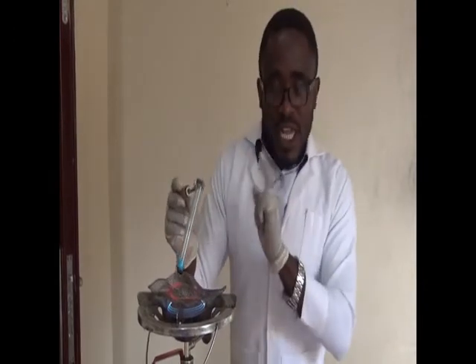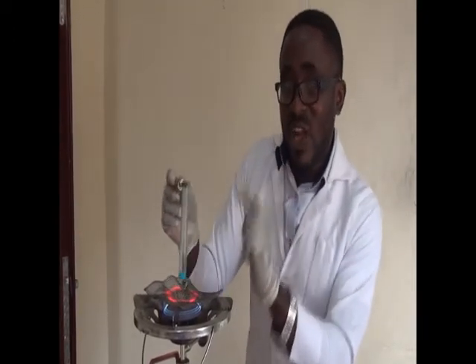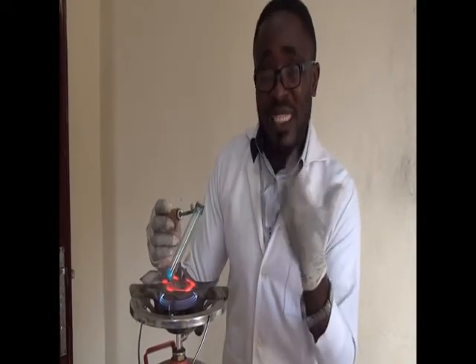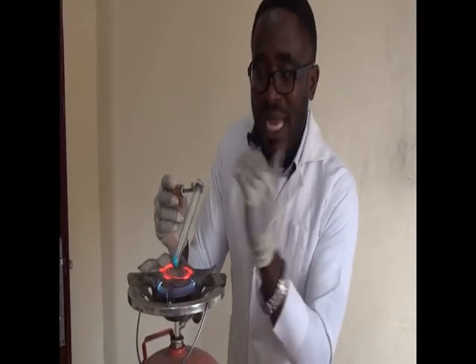Please notice one thing. My test tube is placed slanted and not upright, slanted and away from me, so that if any gas is evolved in the process of heating, I can probably spring it out like what you see coming up.